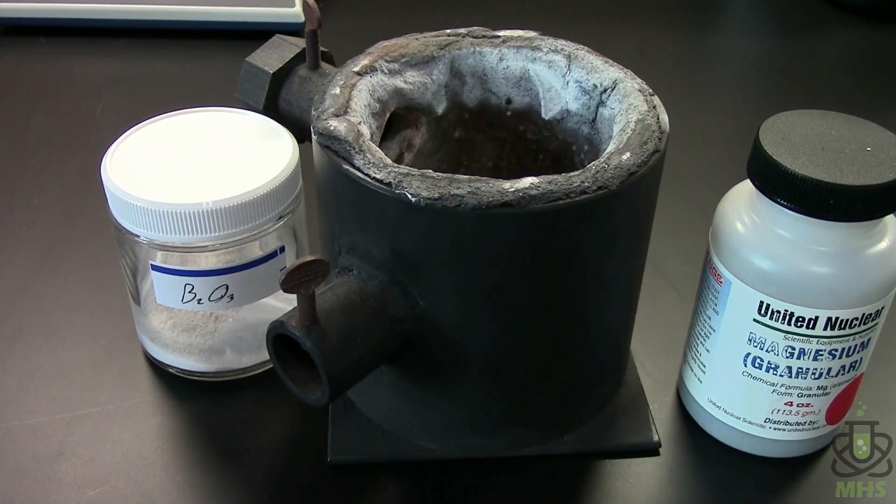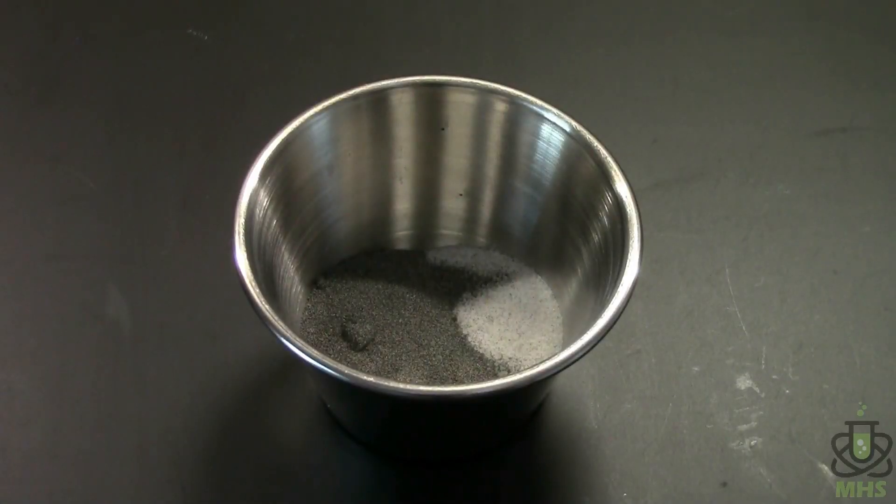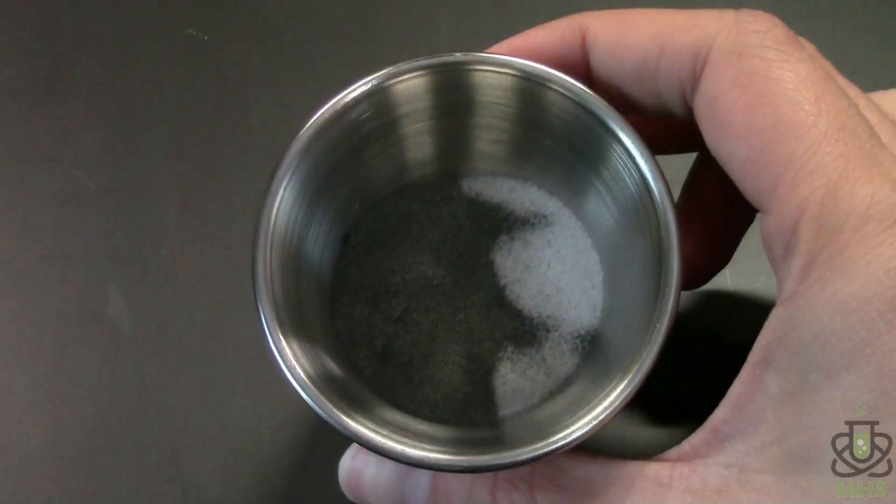For this step we're going to need basically equal amounts of boric oxide and magnesium powder. The stoichiometry says you need very slightly more magnesium than boric oxide, but it's very small so equal amounts by weight should be fine. I weighed out 4 grams each of boric oxide and magnesium powder and put them together — you can see the two powders in here.